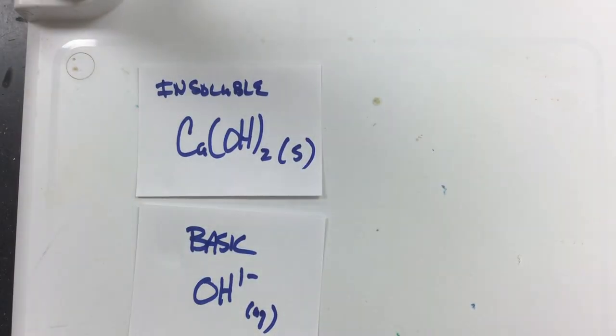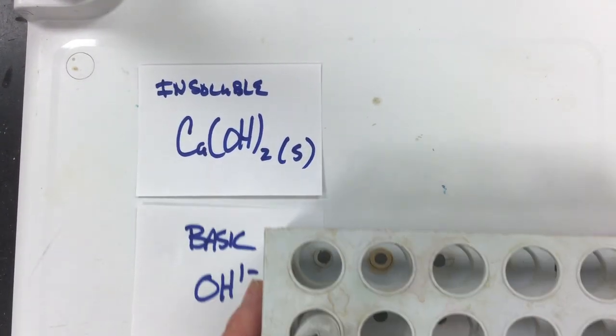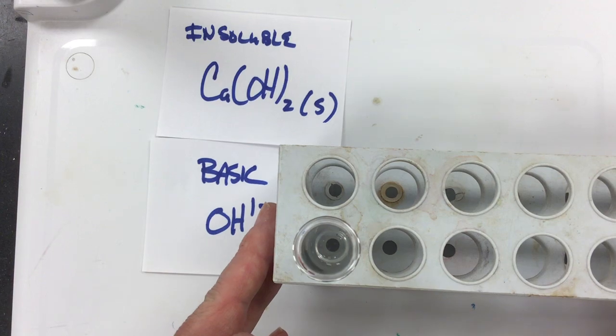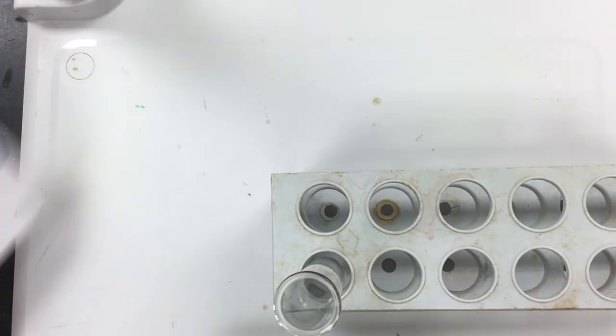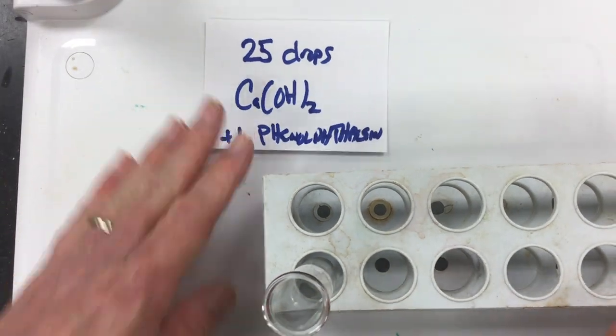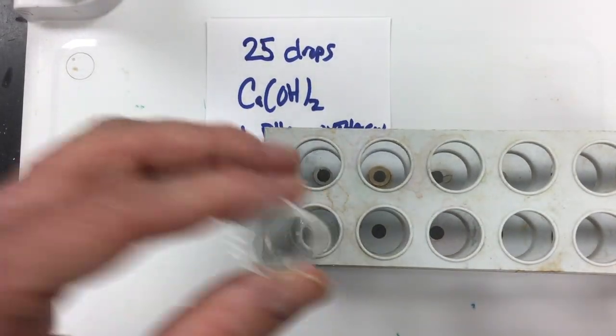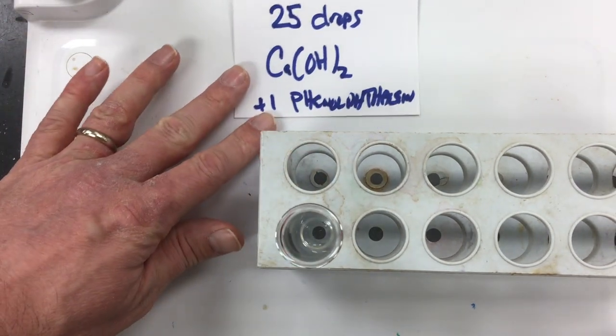So what I have done here is I have taken some of that water that is saturated with the hydroxide and the calcium ions there, and I have put it into a test tube here. And I have put 25 drops of this into the test tube. So here it is, you can see I got 25 drops of it in there already.